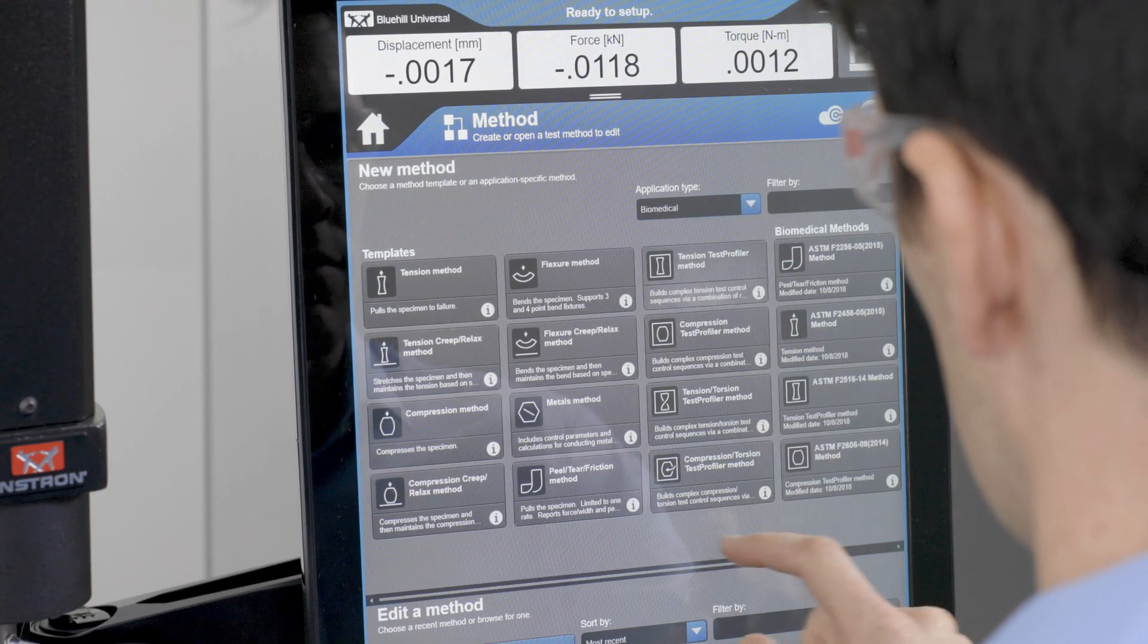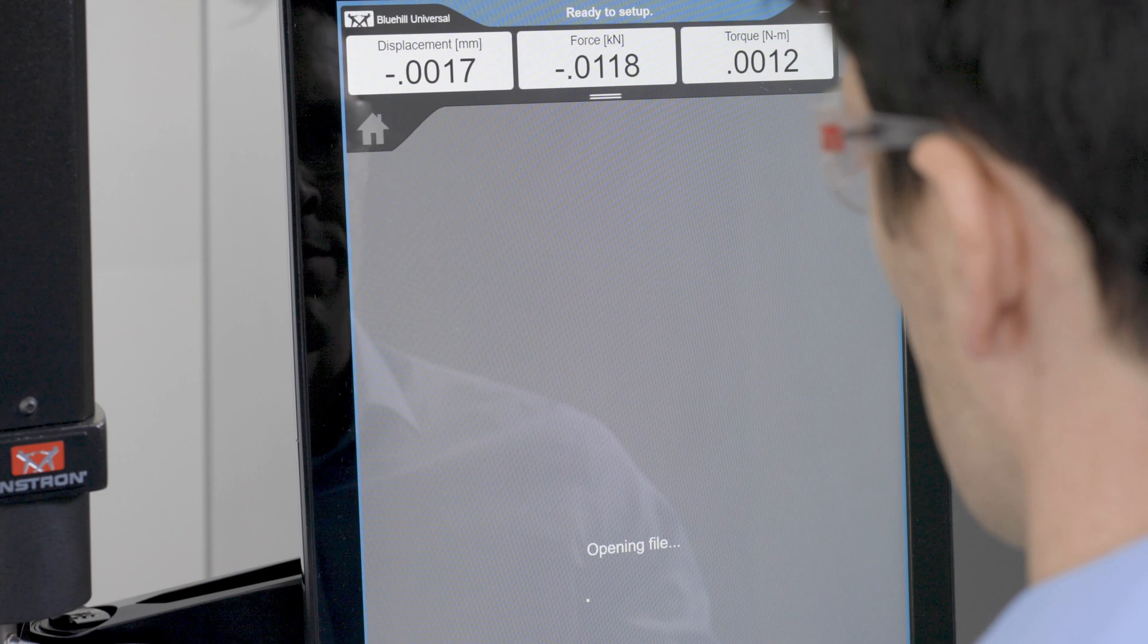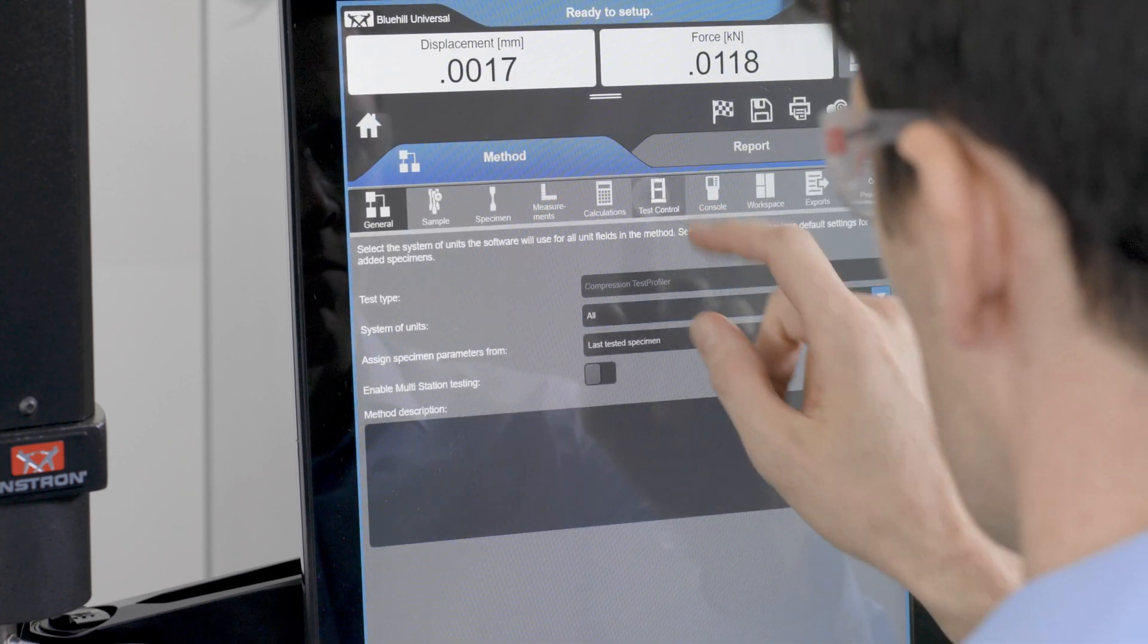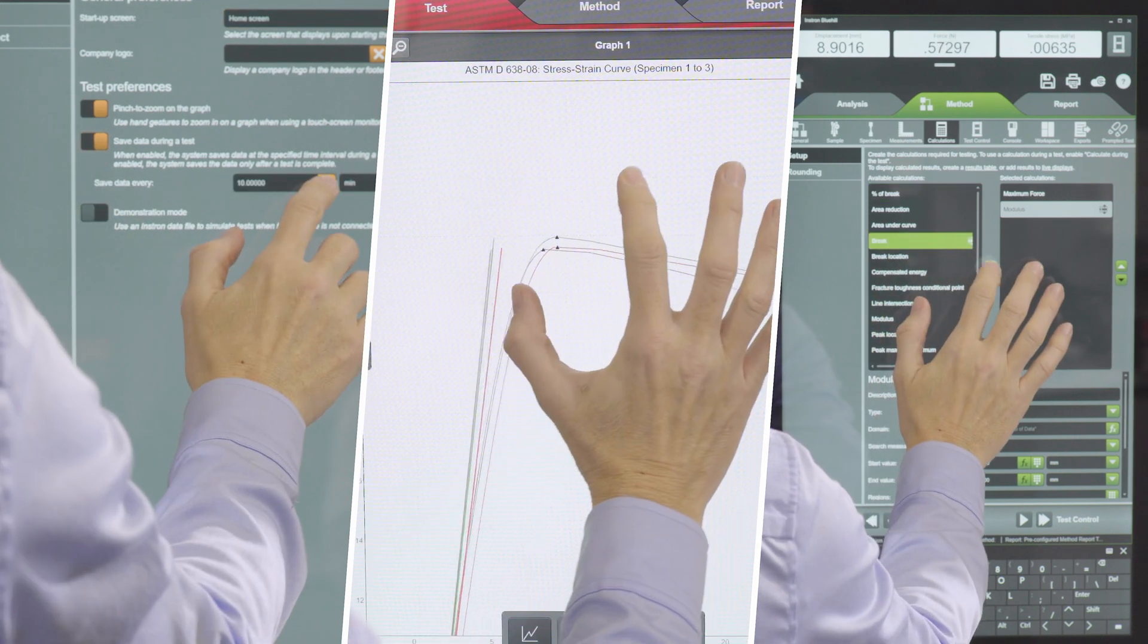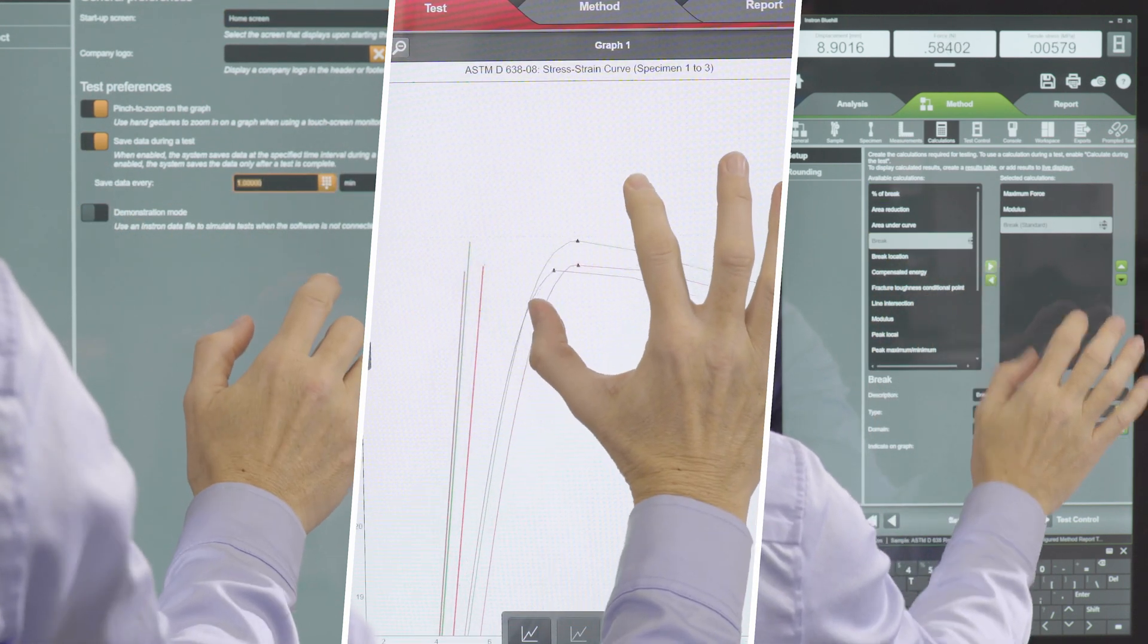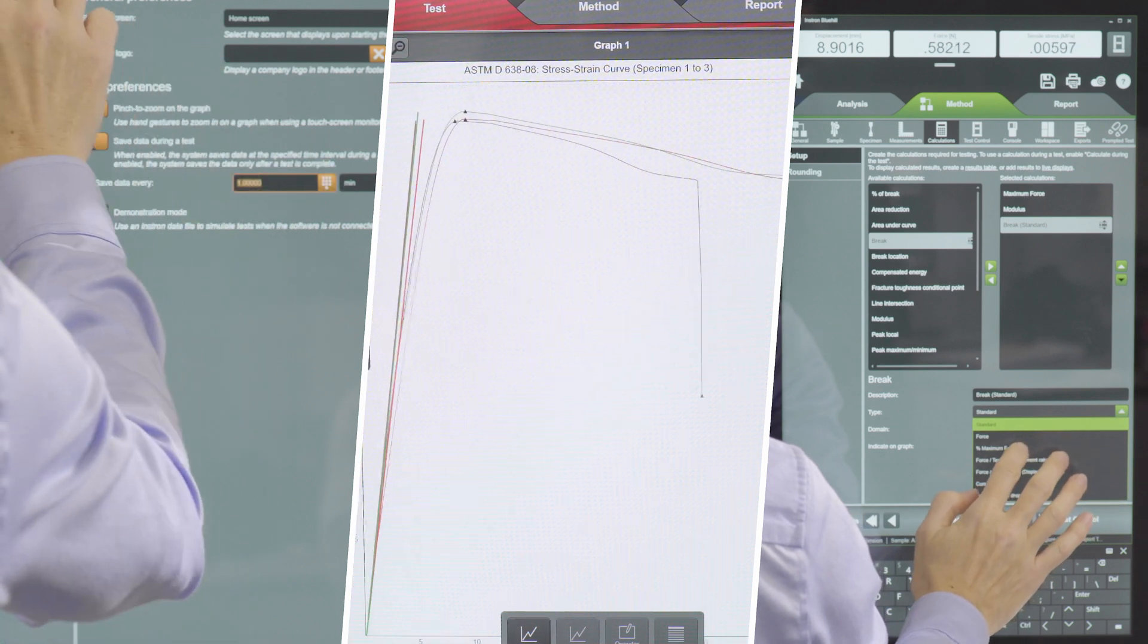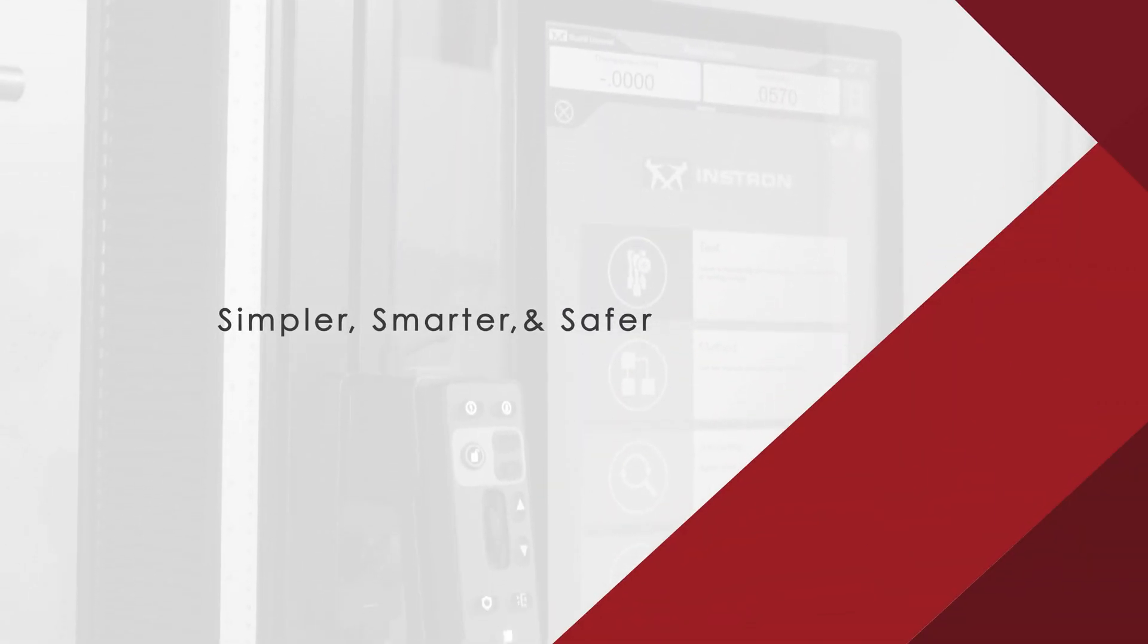Whether you're an experienced Instron user or whether you want to run quick tests from time to time, Bluehill Universal's large touch points, easy-to-follow workflows, and clear indicators of the system status make your testing experience simpler, smarter, and safer.